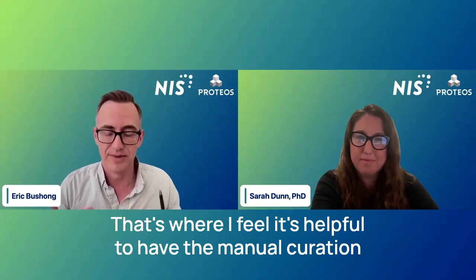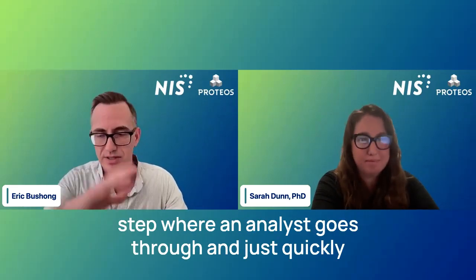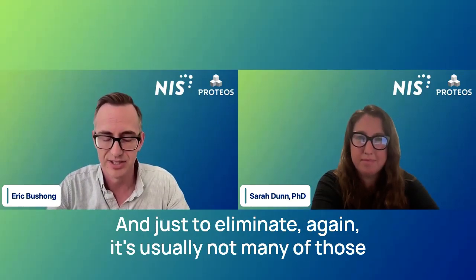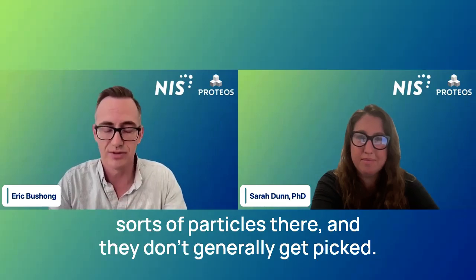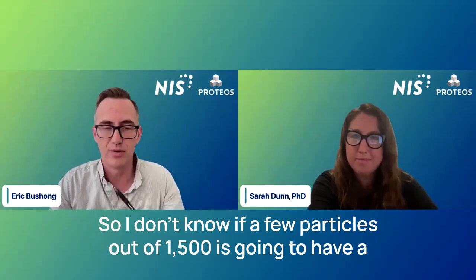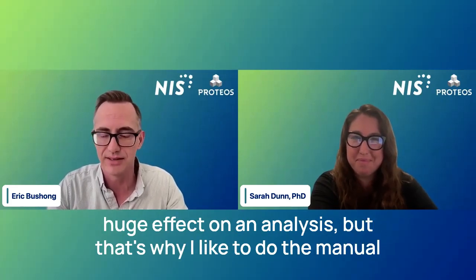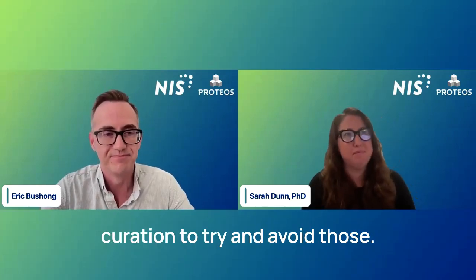That's where I feel it's helpful to have the manual curation step, where an analyst goes through and quickly eliminates those few instances. It's usually not many of those sorts of particles, and they don't generally get picked. So I don't know if a few particles out of 1,500 is going to have a huge effect on an analysis, but that's why I like to do the manual curation to try and avoid those.